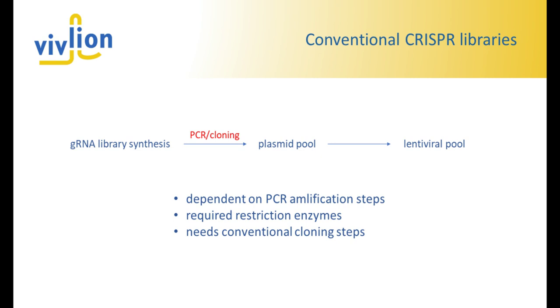When we now close those by homology cloning or by ligases like T4, for example, and then transform them into bacteria, we will get artifacts which either have no guide RNA or are truncated versions of our plasmid. And this is then what we call our plasmid pool or our final library, which will then, of course, also be sequenced.